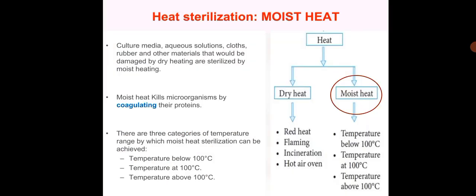Next category is moist heat sterilization. Culture media, aqueous solutions, clothes, rubbers, and other materials that would be damaged by dry heating are sterilized by moist heating.